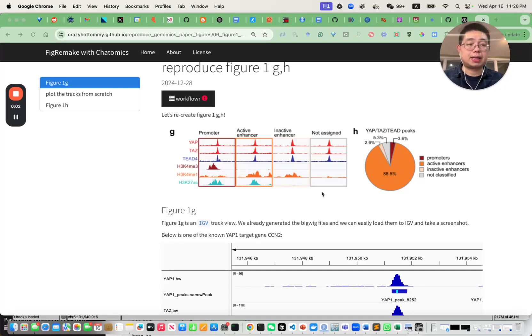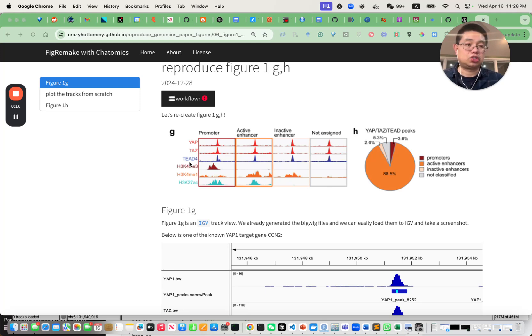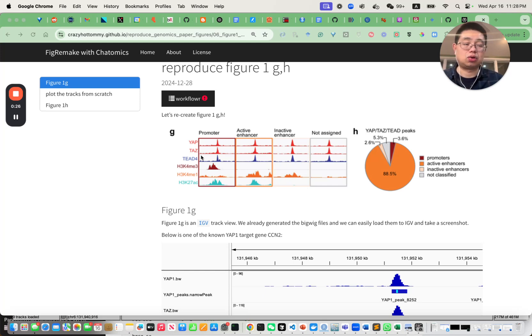Hello, this is Tommy. Welcome back to Chatomics. In today's video, we will continue to reproduce a figure from a genomics paper. In that paper, the authors produced a lot of ChIP-seq data — for example, YAP, TAZ, and TEAD4 ChIP-seq. We're going to reproduce figure one from that paper. Make sure you watch the other videos in the same playlist so you have the context.